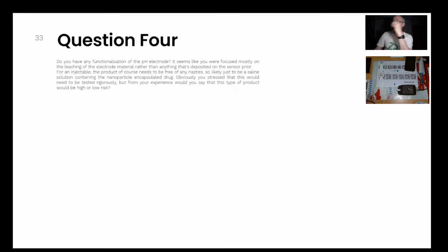So question number 4. We at ZP do functionalize our pH electrodes to make them sensitive to pH. Those materials, I cannot reveal them, because we do have to keep some trade secrets here. But I do not believe that they will leach, and I do not believe that they are toxic.